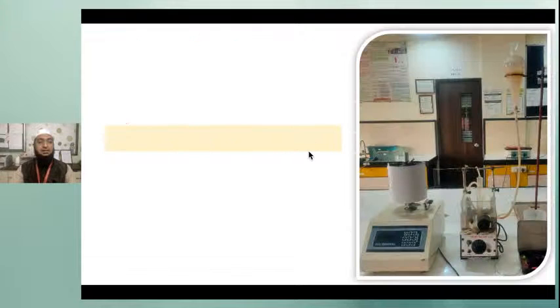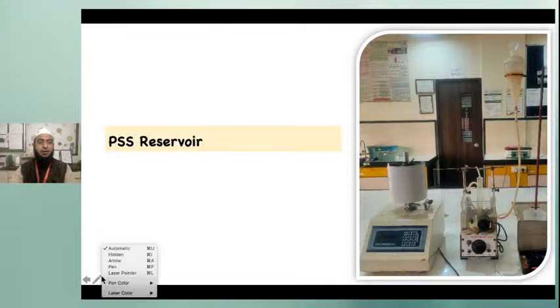Next one is the physiological salt solution reservoir. It is a simple reservoir. You can use any type of vessel. I have used this setup. The funnel is there so that you can add physiological salt solution as and when required.